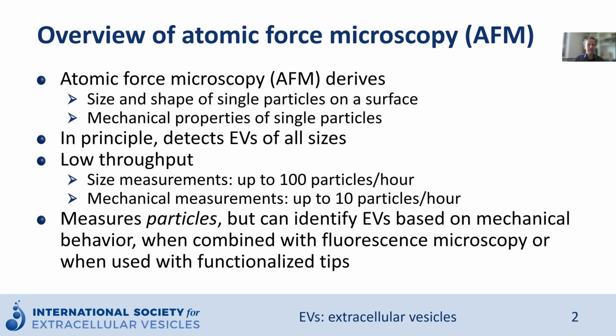In principle, AFM measures any particle, but it can identify EVs based on the mechanical behavior that the particles show, but also when the technique is combined with, for example, fluorescent microscopy, or when using functionalized tips, EVs or even subsets of EVs can be detected.